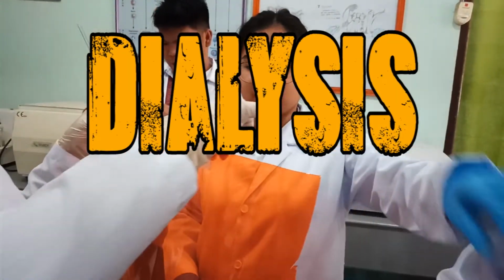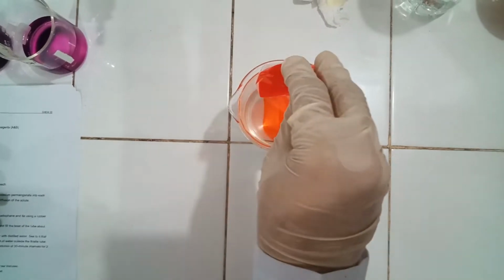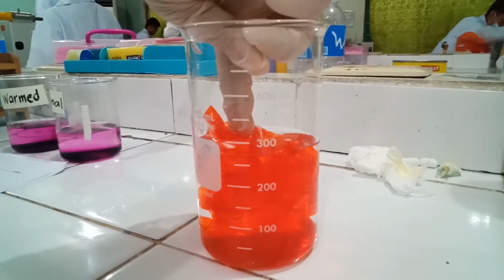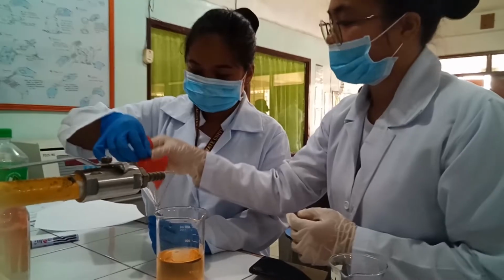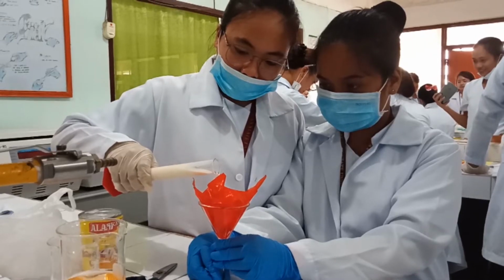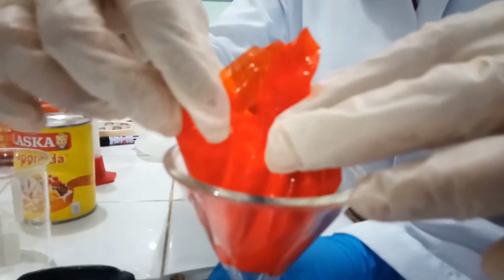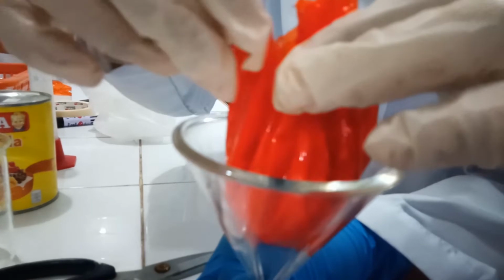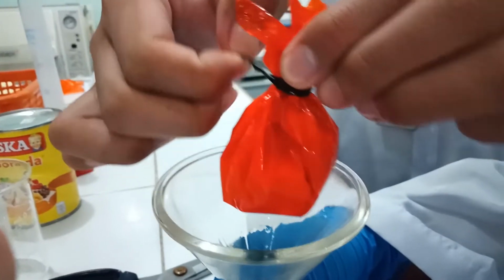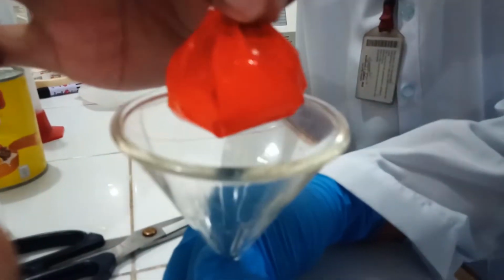Procedures for dialysis. First, cut 1 square foot of cellophane and soak it in water for a few minutes. Second, fold it like a filter paper to fit into a glass funnel. Third, pour 50 ml of milk in it. Fourth, collect all the edges of the cellophane and tie with string to secure them. Leave some air space above the milk.